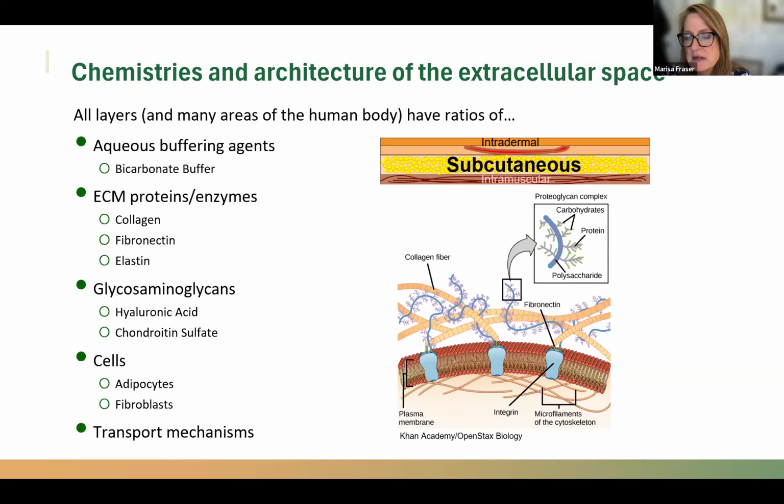Great, thank you. Is your assay sensitive enough, or will a high prodrug amount be needed? Have you performed any assays with long-chain fatty acid prodrug molecules? I may have to defer to Amy here, if she remembers whether we have any long-chain fatty acids and the concentration that we were able to detect. Yeah, and if we can't answer it here, we can always follow up with the email. Yeah, for this one, we may have to follow up offline. Off the top of my head, I don't have that information, but we can definitely look into our archives and double check for you. Great, thank you so much.